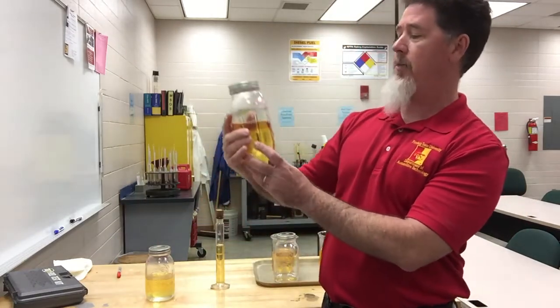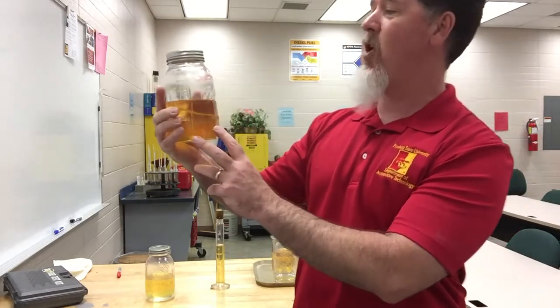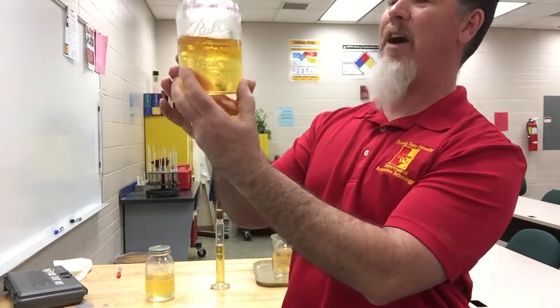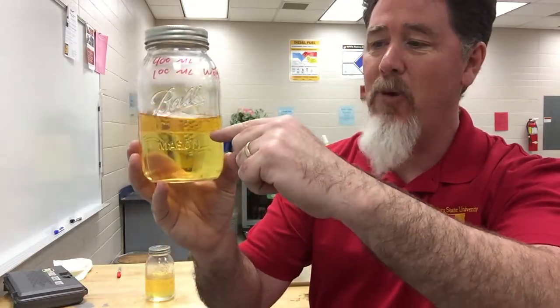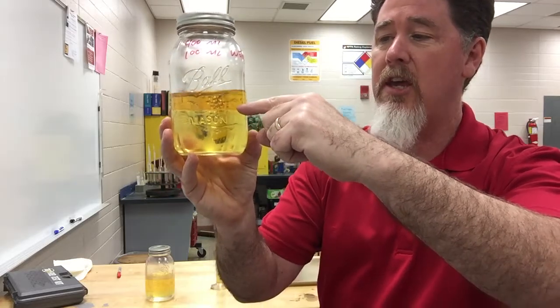This is a container of 100 milliliters of water and 400 milliliters of gasoline, regular gas. I'm sorry, this isn't gasoline, this is E85. I don't put any indication on here because I have the students try to figure out what it is. But if you take a look at it, there's a separation line right there. That's what happens.